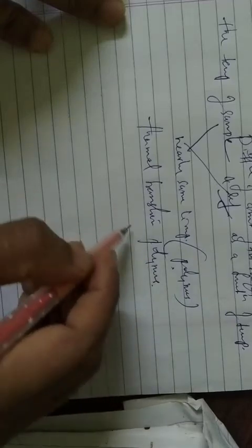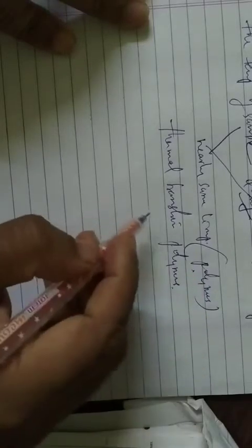This technique is used to study what happens to polymers upon heating, that is, the study of thermal transitions in polymers. In the previous video we saw, for example, the melting of crystalline polymers, the glass transition temperature, and crystallization.